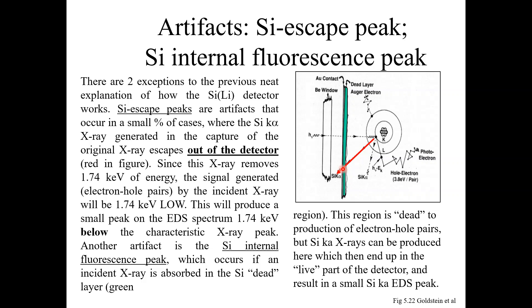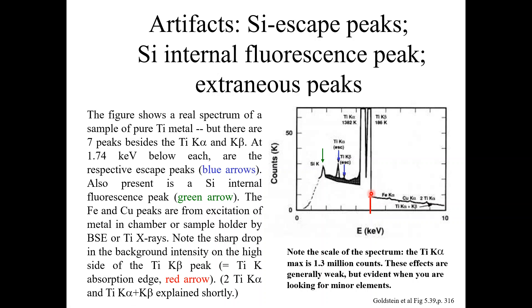Here you can see a real EDS spectrum of a titanium metal sample. Besides the titanium K-alpha and titanium K-beta peaks, there are seven additional peaks. The escape peaks — shown with blue arrows — appear at 1.74 keV below each respective titanium peak. Also present is the silicon internal fluorescence peak, shown here with a green arrow.